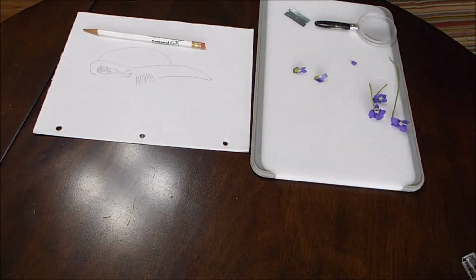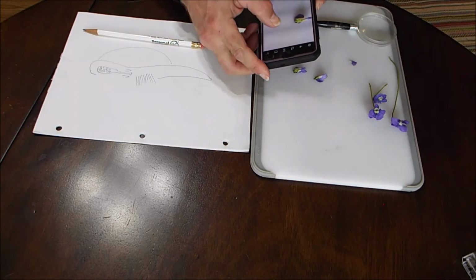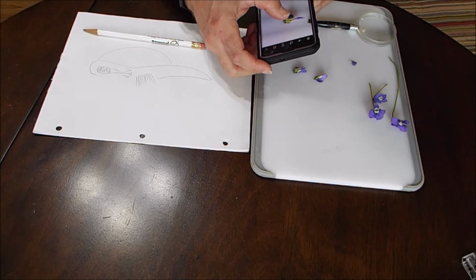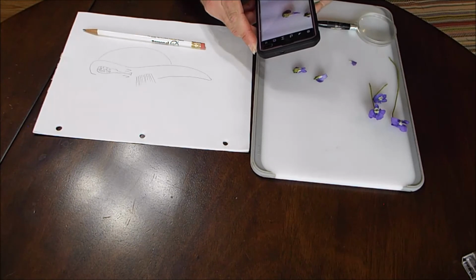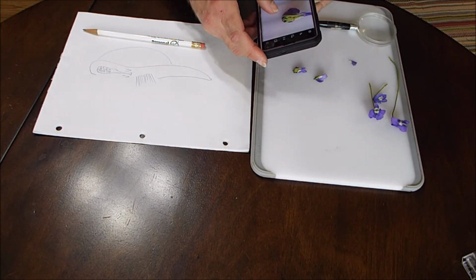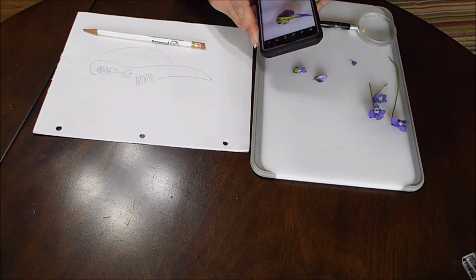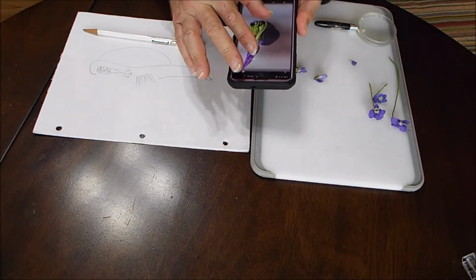Now I'm going to try a trick that might work. If you have one of those little macro attachments to your phone, this might work really well, but I'm going to get as close as I can to where it'll still focus. Now this camera has a pretty good zoom function, pretty good macro mode. I'm going to photograph it. And now that I have a picture of it, I can just blow that up.